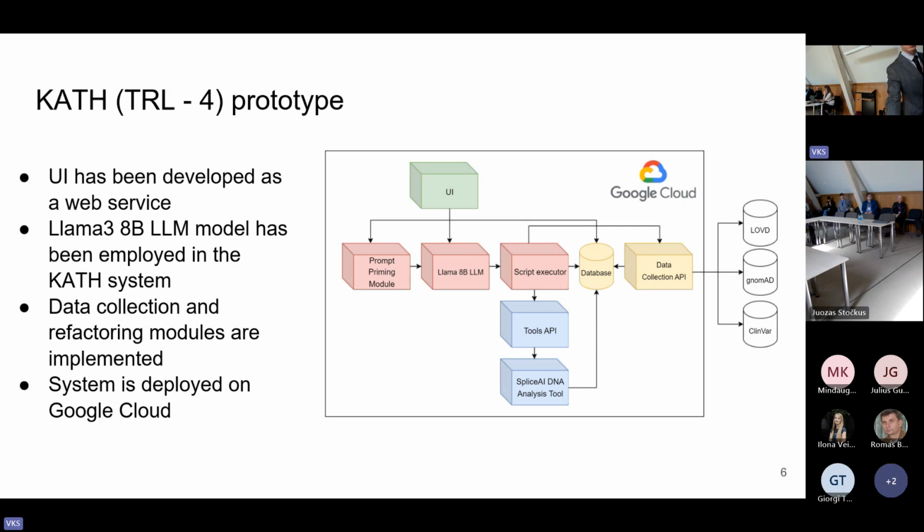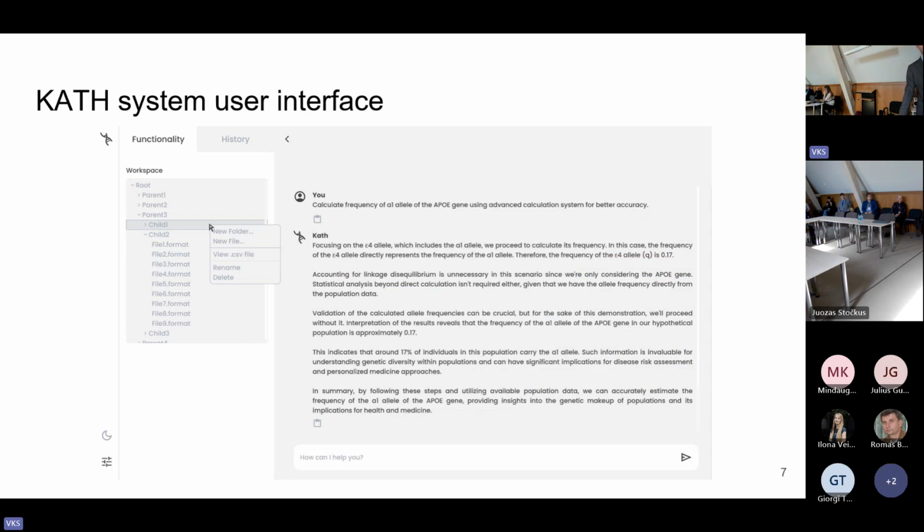And let's talk about the UI. This is the current idea and it is almost implemented. We wanted to provide users the ability to have a workspace to view files and manage them. And we also decided that the user interface should be as similar as possible to the current LLM solutions to make it more user-friendly. In future, we will develop more features for the user interface, for editing sheets, viewing code-generated output, and so on.